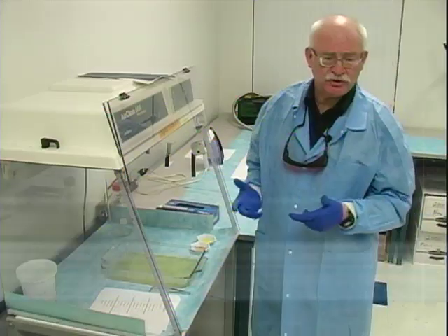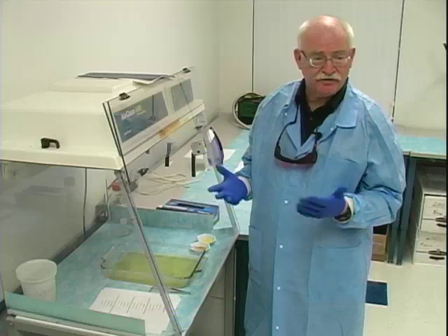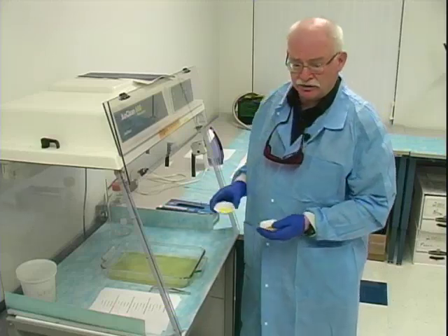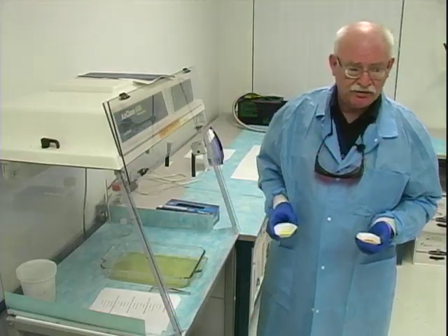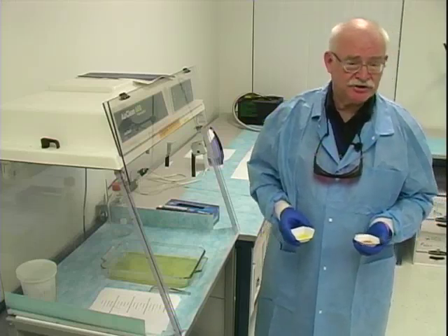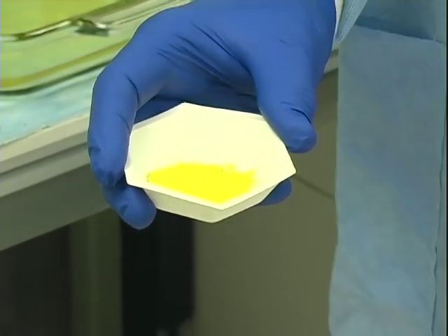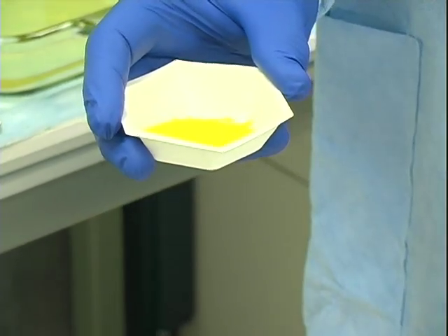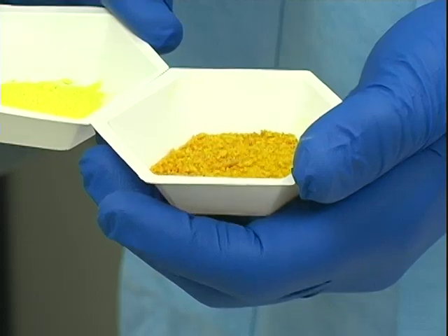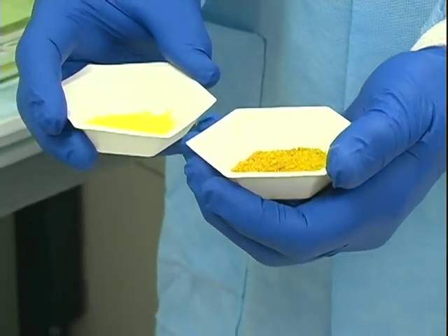The first step in the sequential processing of paper documents is the amino acid stage. For today's work we have selected the indanedione reagent. Before we get to using the actual solution, it's important to note the difference in the products that are on the market, as these may have an impact on your results. One product is a very uniform, finely subdivided yellow powder, while another is a more crystalline, darker colored product — and immediately you can see that there is something very different about these two products, even though both are listed as indanedione.